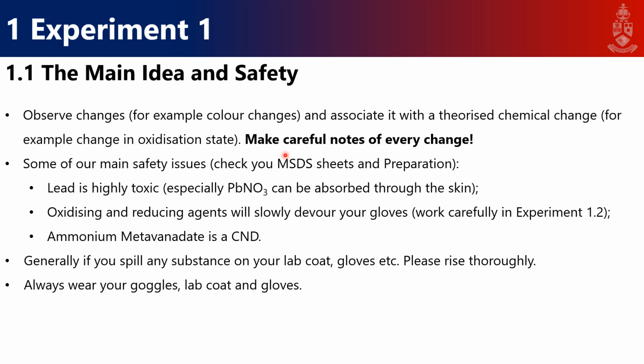and see what happens if you change from acidic to basic medium, or have no medium, let's just say a neutral medium. What is the effect on what you can observe? Is there gas evolution? Is there a color change? Is there release of heat? Is there absorbance of heat? So make notes of everything that you see. It aims to teach you to make observations in the lab.